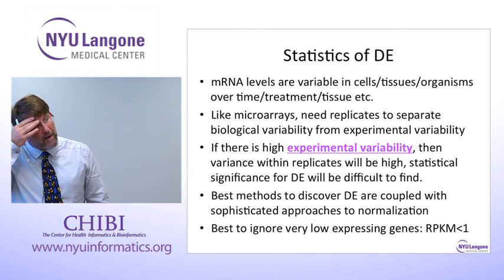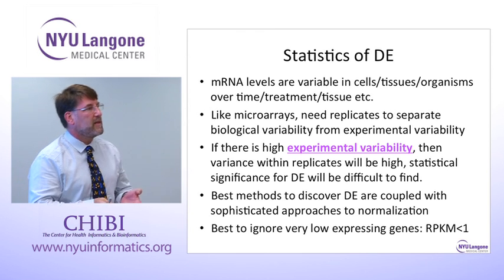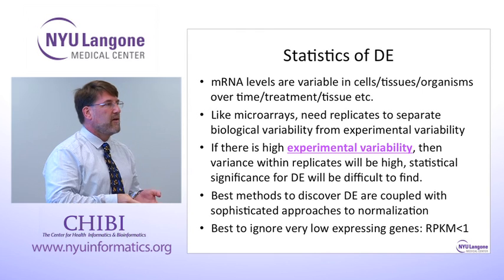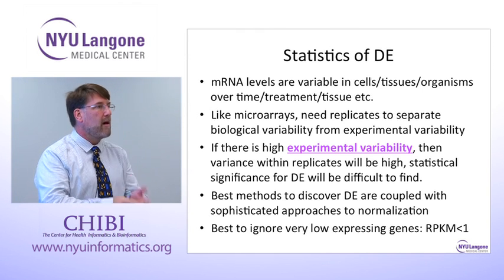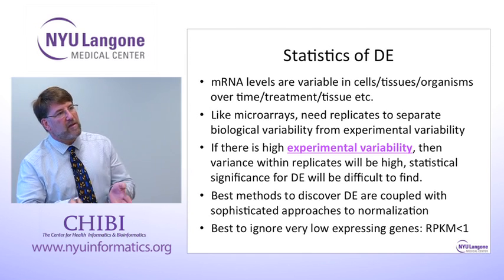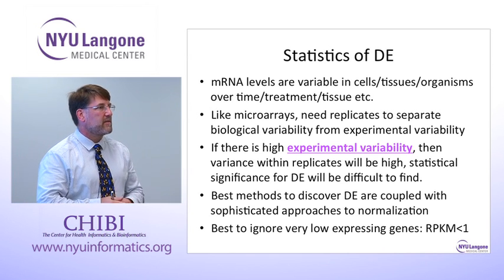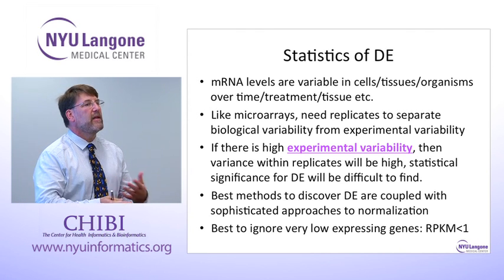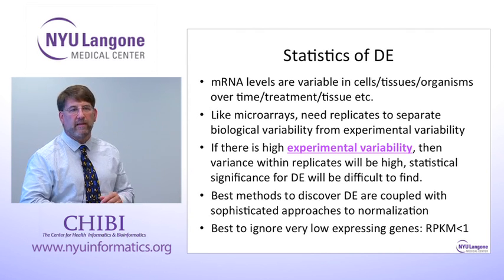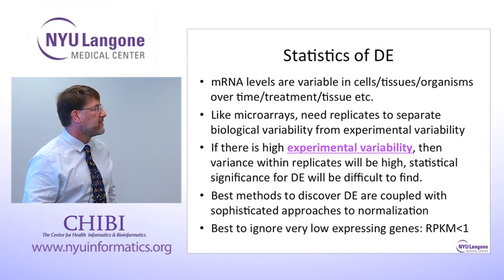So my point here is that more replicates will give you more precision in the measurements of gene expression changes for many of the genes, except for those that are extremely low expressed, at which point you need to trade off deeper sequencing versus more replicates. But I'd rather be more sure of the results that I published and be willing to miss a few genes at the low end of the spectrum rather than have fewer replicates and a poor estimate of variability on all the genes that we measure.